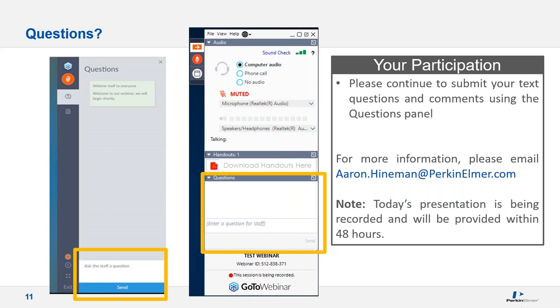It's based on the maximum daily dose, which is also dependent on the route of administration, whether it's oral, parenteral, or inhaled. It's also dependent on the sample prep, how much the sample is diluted. It's dependent on a bunch of different things: the dosage, the route of administration, and basically your preparation factor. It's factored into that value. So it's a maximum limit for that elemental impurity based on the type of drug and how you're preparing it. Yeah, it's a good question. Didn't really explain it in this one.